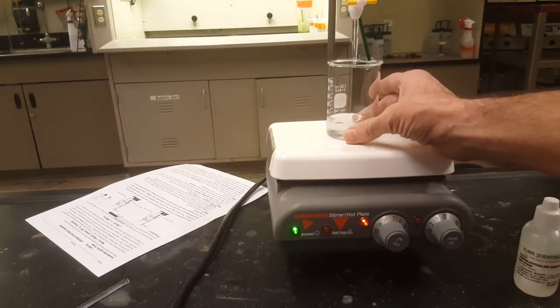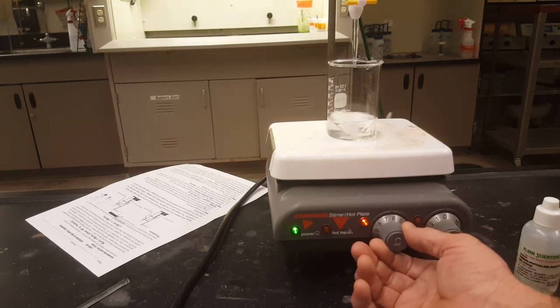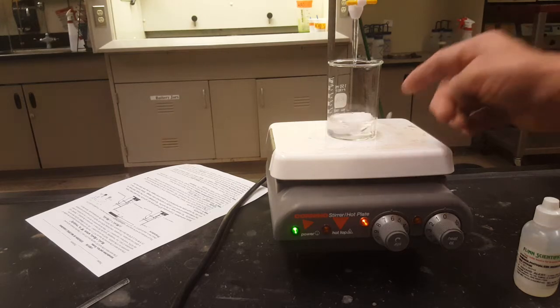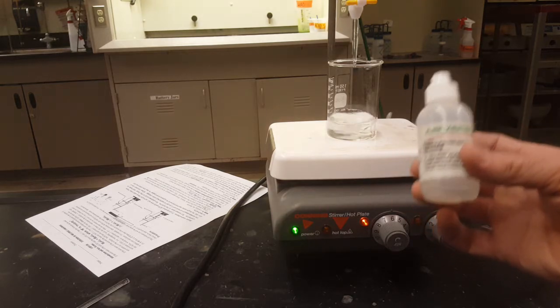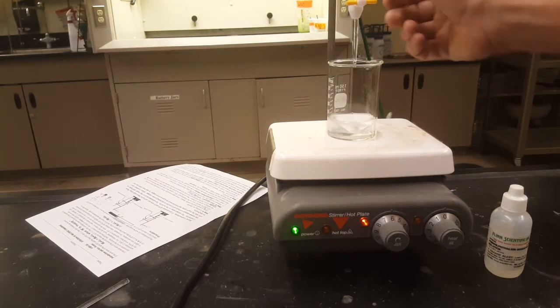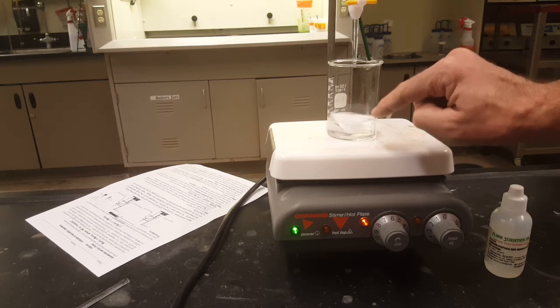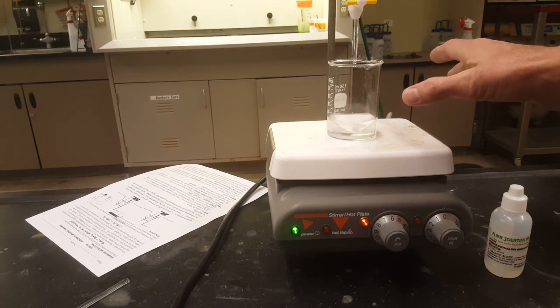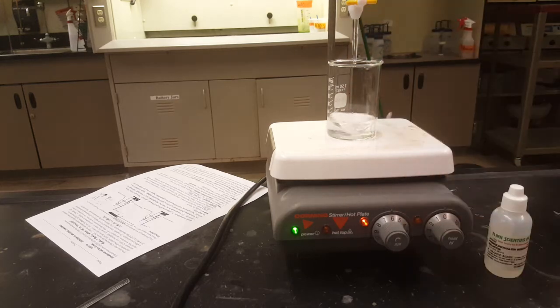There's a speed that is perfect, and that speed, I think, for today is between 6 and 7. You have 1 drop of indicator. Remember your indicator. If you don't have an indicator, this isn't going to work today. And you're going to add your base until you start to see flashes of pink color. And then you're going to slow down and add your base 1 drop at a time until it turns pink and the pink doesn't go away. Then you'll get your final volume of your base, and you'll be able to do all of your mathematics.